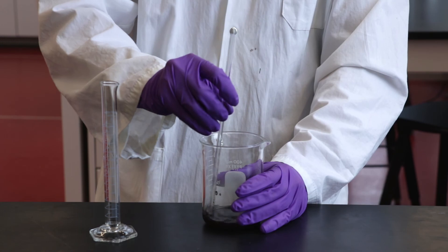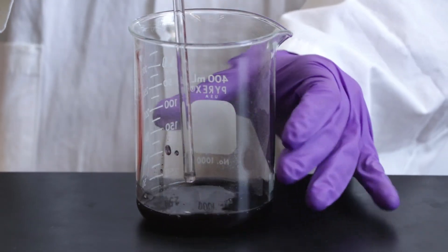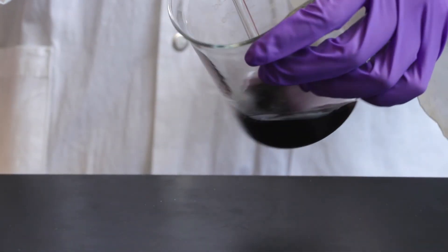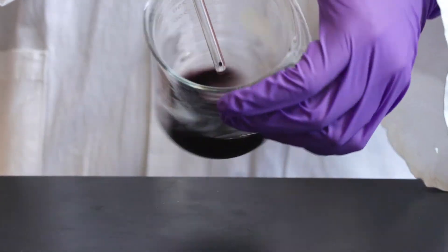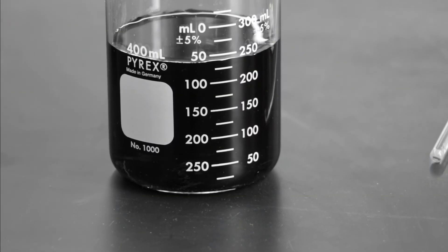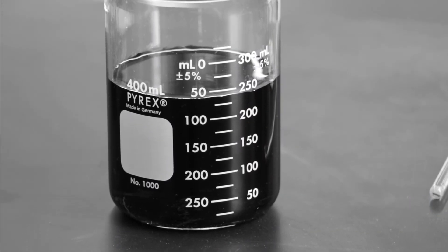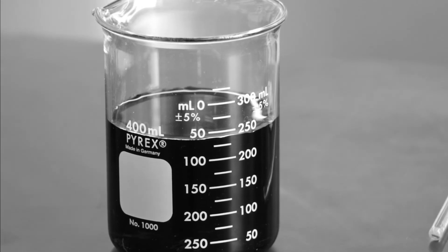Stir with a glass rod to ensure that all of the Kool-Aid is dissolved. Sometimes more solvent may be needed to dissolve all of the solid. Beakers should never be filled more than 65% of their total volume as they can become difficult to manipulate.